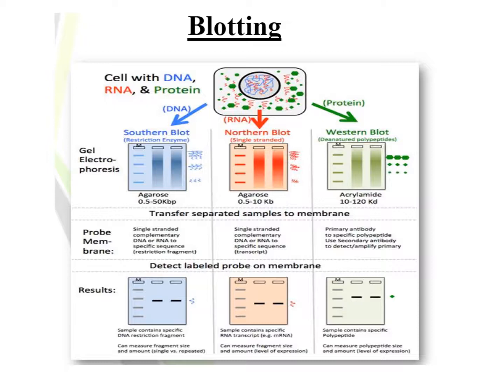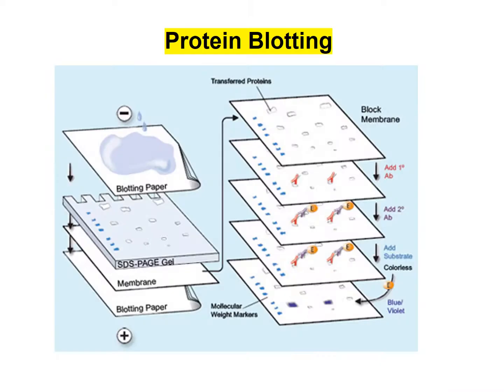And you can measure the intensity of this. So how much protein is in this cell line versus that, or in that cell fractionation sample, or in that organelle fraction, right? Or this is mitochondria, this is nucleus. Is the protein in both places, or in one or the other? Western blot allows you to look at that.